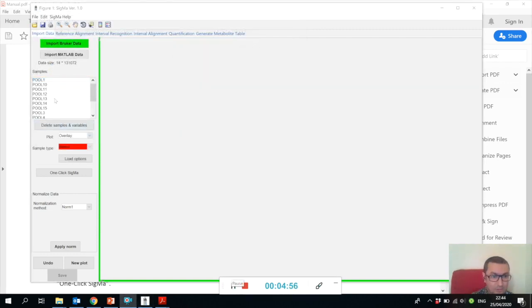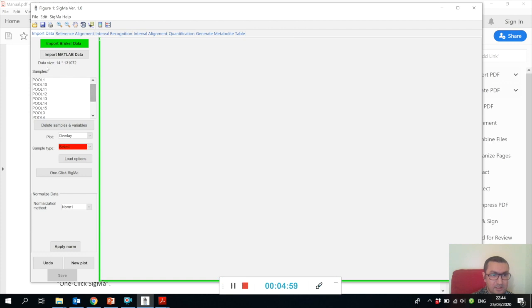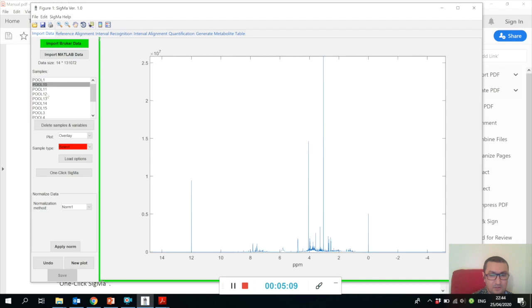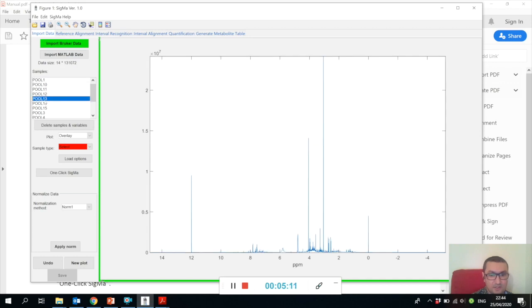When you open the spectra, you will see immediately the size of the data that you just imported. The button that you use for importing the data will become green, so you can start looking at your spectra just by clicking examples.